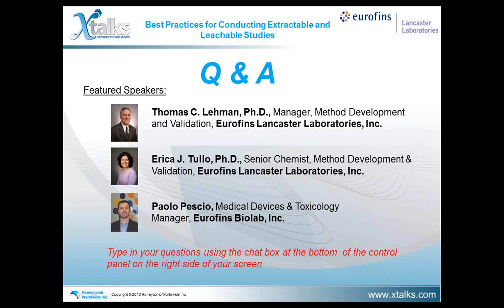Okay, thank you. Do you need the API in these experiments, or is the matrix enough? Your thoughts? When doing a simulation study, normally the matrix is just enough, a placebo solution, but when you move on to your leachable testing, you are going to want to do it with the API since that will be interacting with your component or your storage container. Okay, thanks for that answer as well.